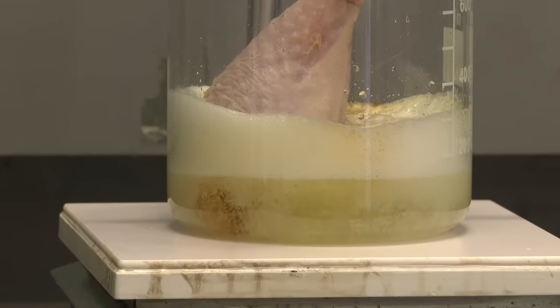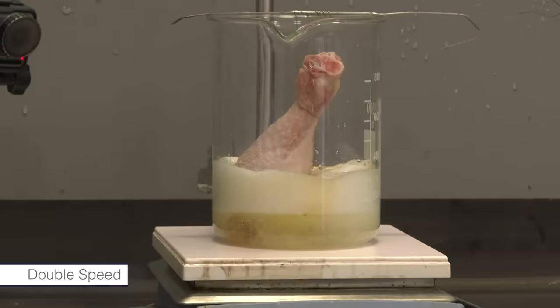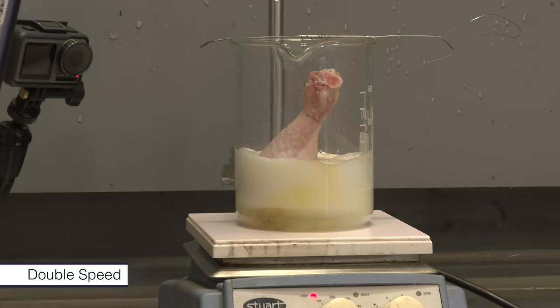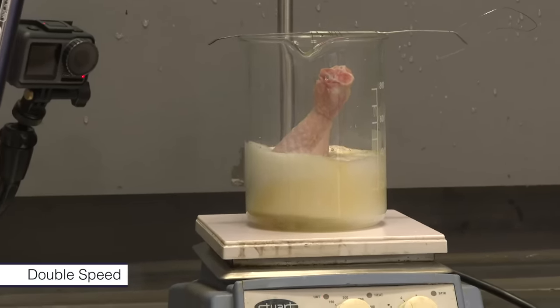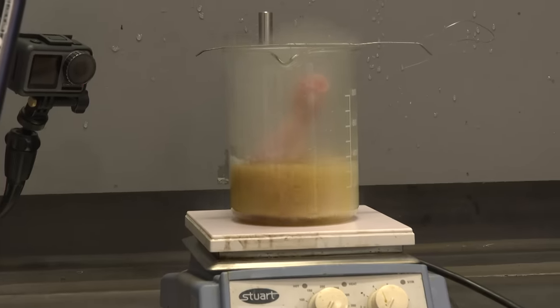It's getting there. I think it's going to fizz. But gradually, Neil got a bit more impatient. So Neil gradually put more and more of the chicken leg into the acid, eventually cutting the wire so that most of it was submerged.